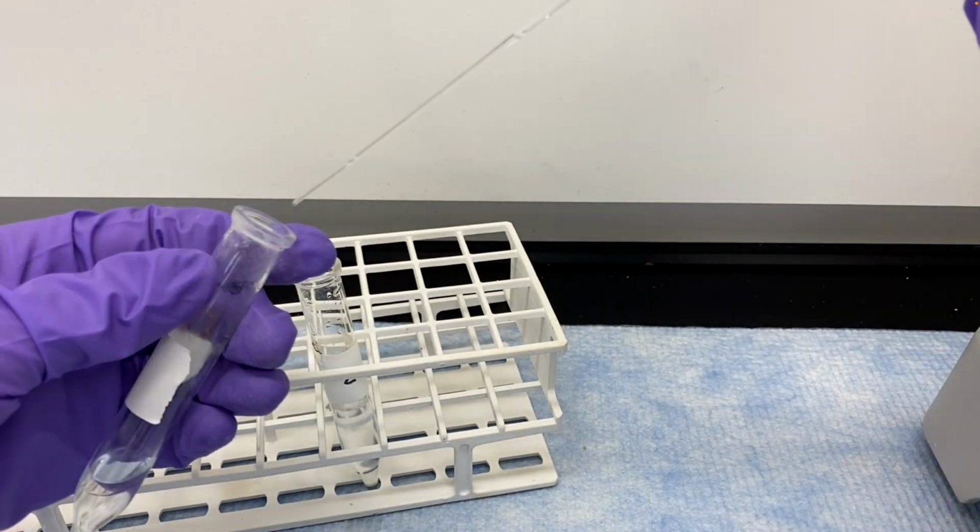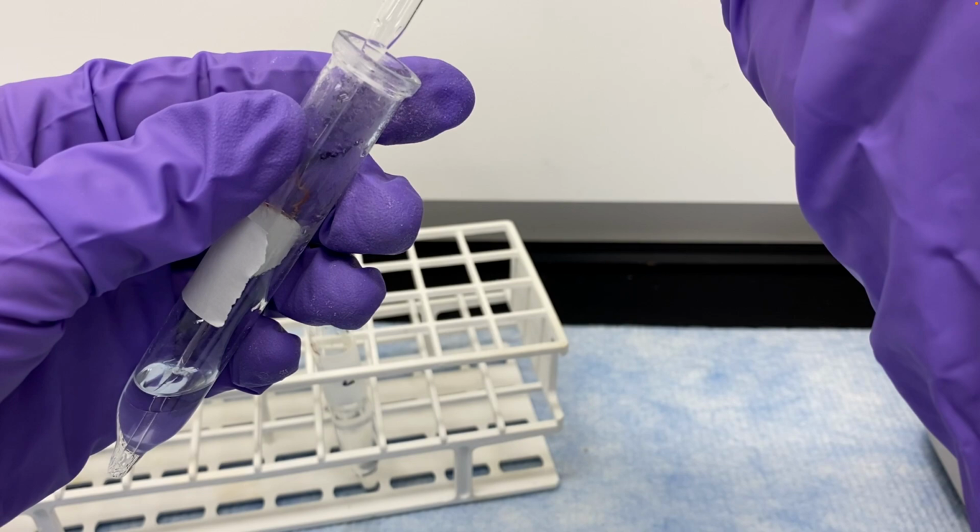One tip is that as the two layers get close and you want to stop, you don't want to transfer the top layer. You want that to stay in there. And it can get a little tricky to remove just the bottom layer and not the top.